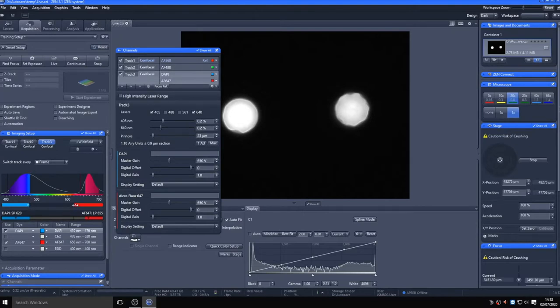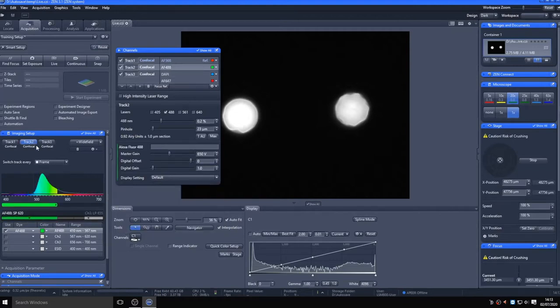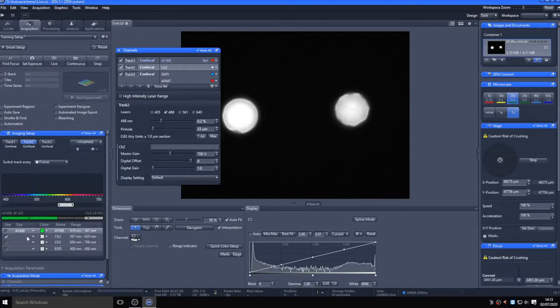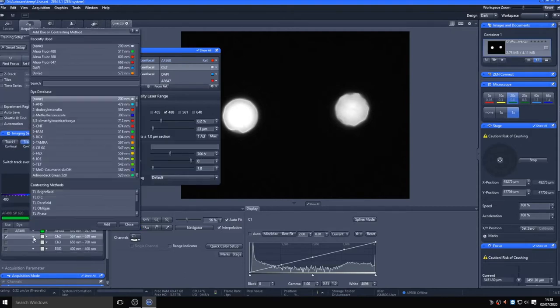Detectors one and three are standard GaAsP PMTs, and the second middle detector is the Aryscan array detector, which is operating in confocal mode. Here, the 568 channel is being directed to the middle detector, as the variable dichroic blocks, assigning the emission between 560 and 620 nanometers to that detector.